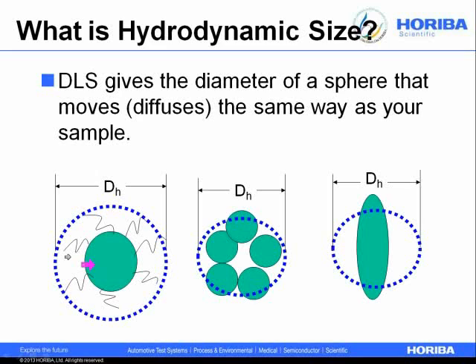When you examine this particle by dynamic light scattering, you'll actually measure this entire species. So that's quite convenient. Another point is if you have an aggregate, a whole bunch of particles that are stuck together, you might look at these by X-ray or microscopy and say, oh, I have a little tiny particle that's just this big. But when you put them in suspension and these five are moving together as a group and do not break up, the size you measure is the size of this aggregate. And so some of the things you might do in preparing your suspensions is to break up these aggregates.